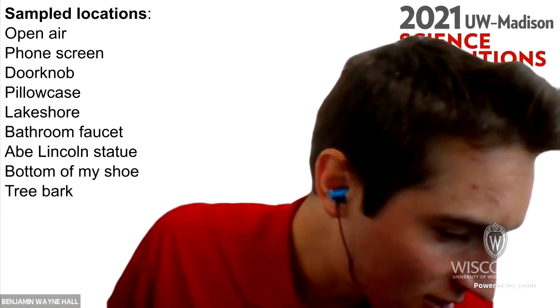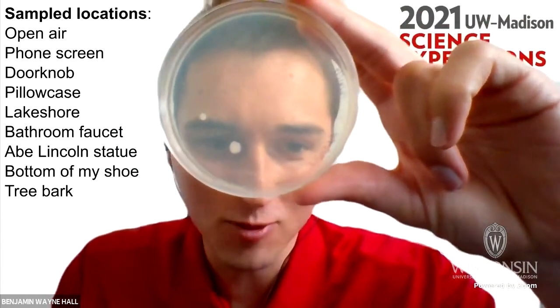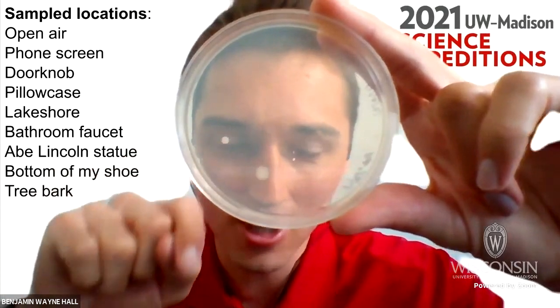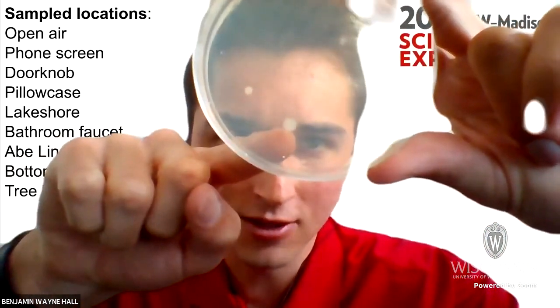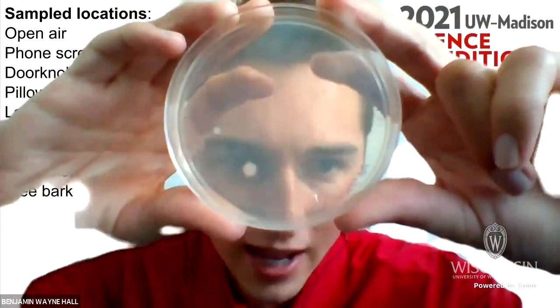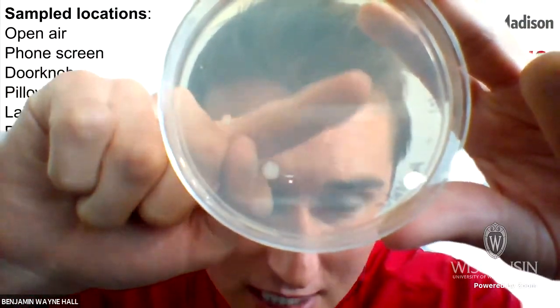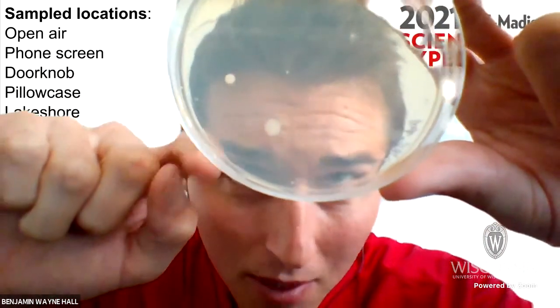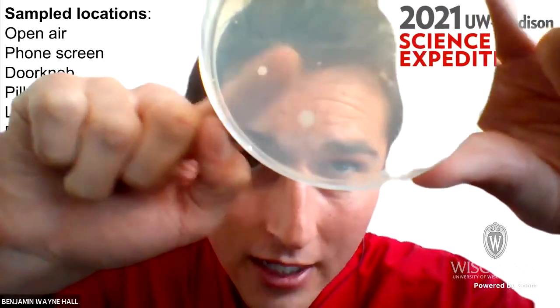Okay, and I think the last one that people had mentioned in their guesses was the Abe statue. So again, I sampled his foot, and here's what we see. I got two nice big colonies. Again, slightly different shapes. This one is a little less circular than this one. And then we also have, if the camera will show it up, this colony that's sort of fuzzy, doesn't really have a nice circular shape. And then we have some smaller colonies off to the side of these.